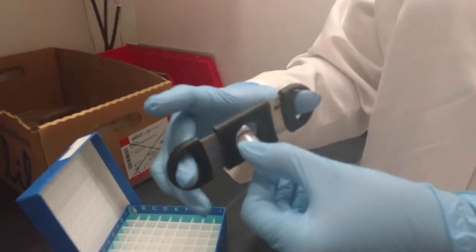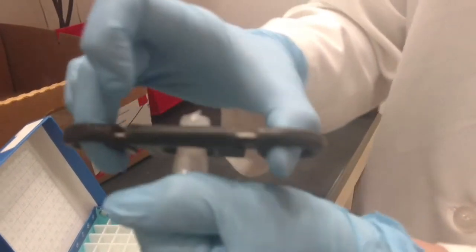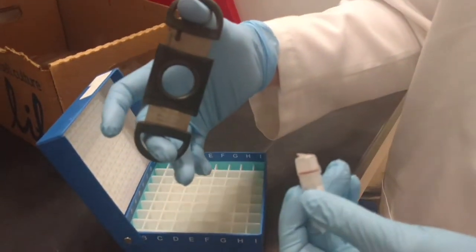Just below the cap, close the cigar cutter and rotate the cryovial. Do not stick your finger inside the cigar cutter.